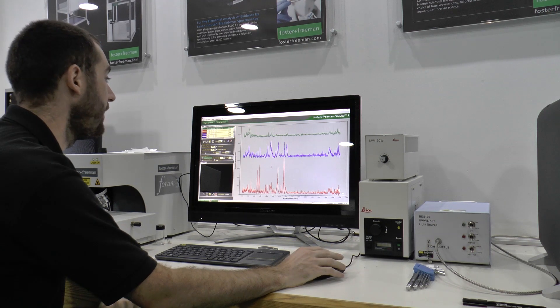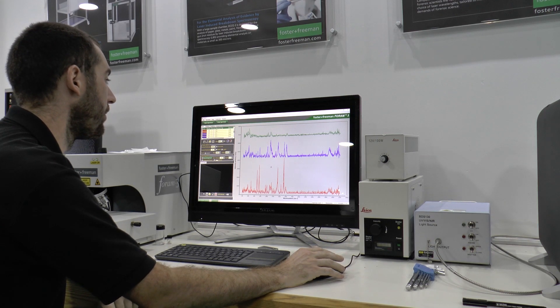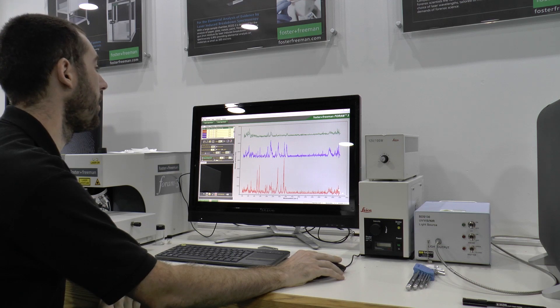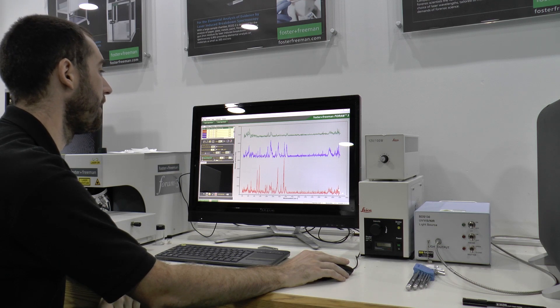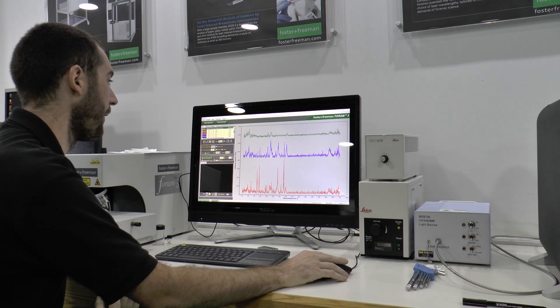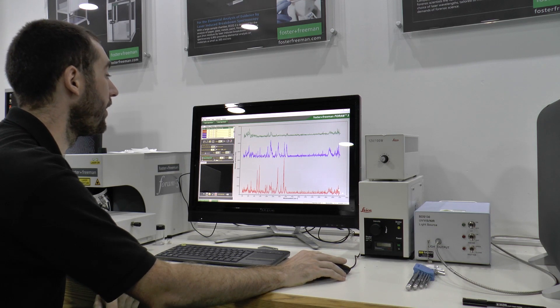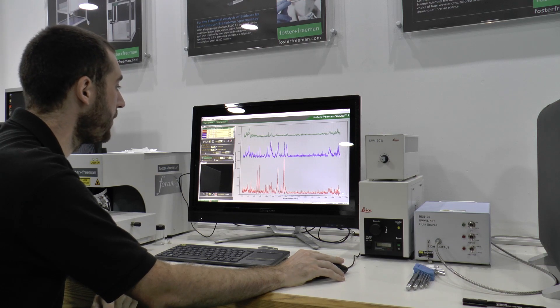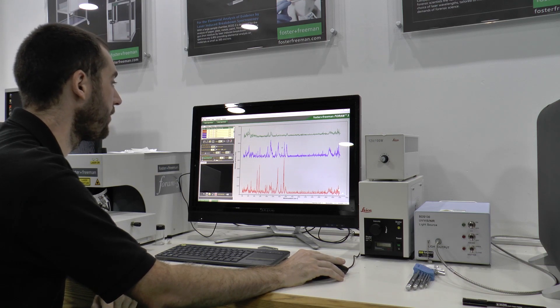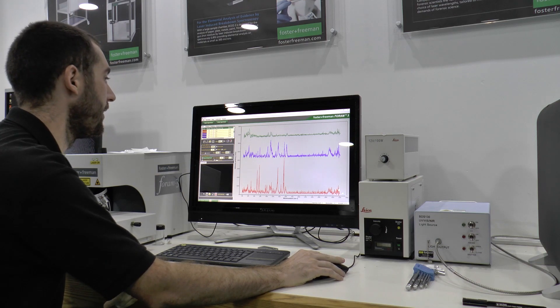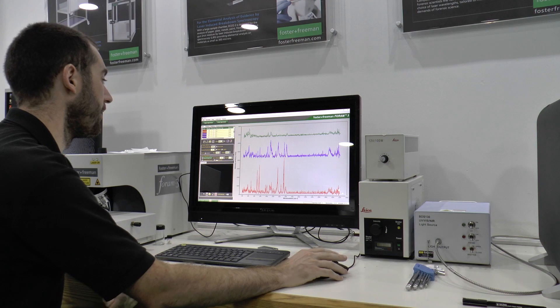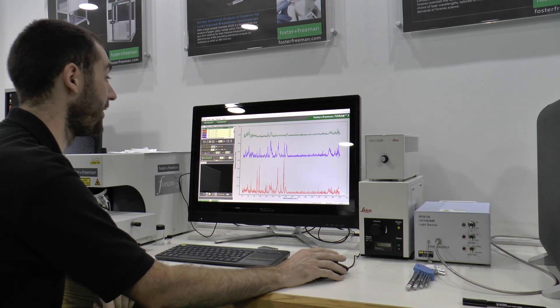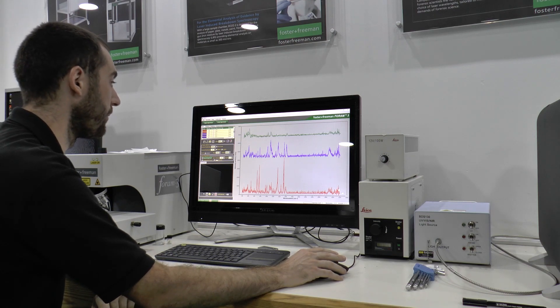Here we have in green a third example from a different banknote and we can quite clearly see a very visibly different spectra. There are the presence of some of the dominant peaks in the other spectra but visibly we can see that this is quite different and we can analyze this statistically as well.